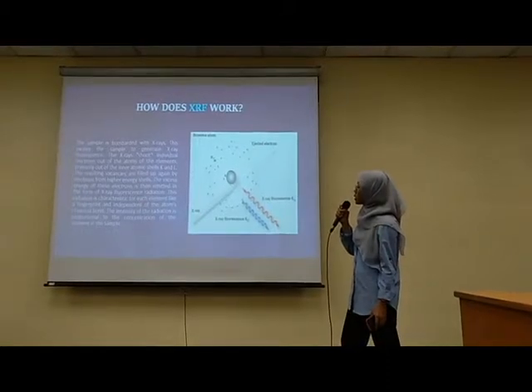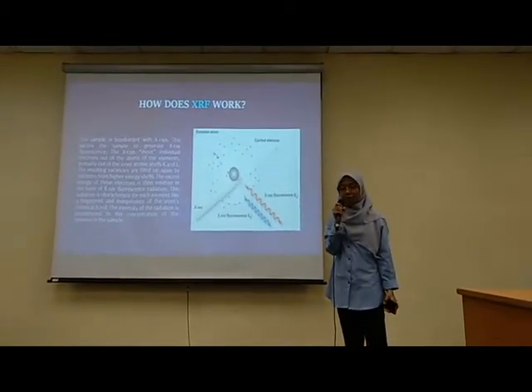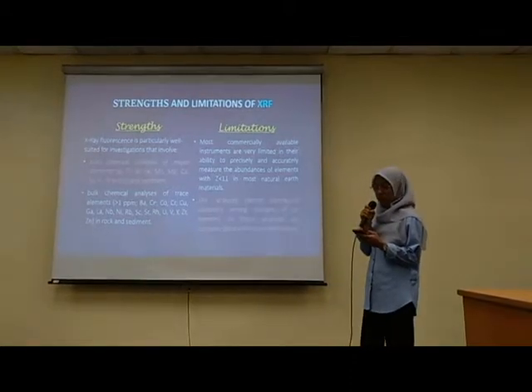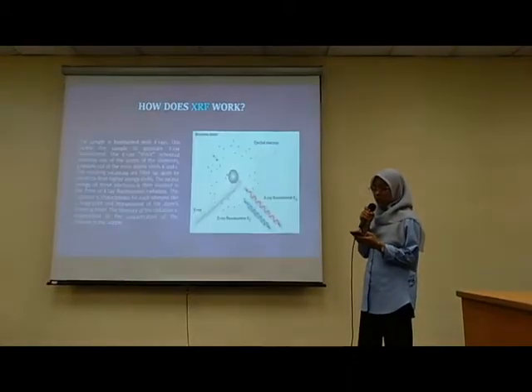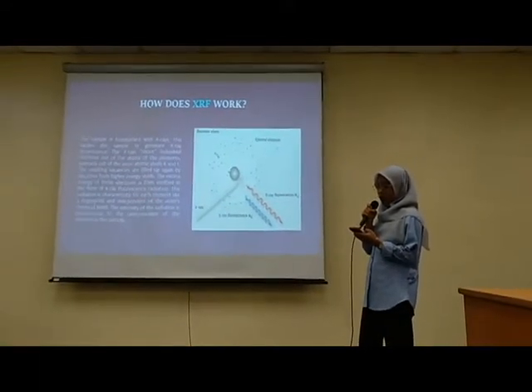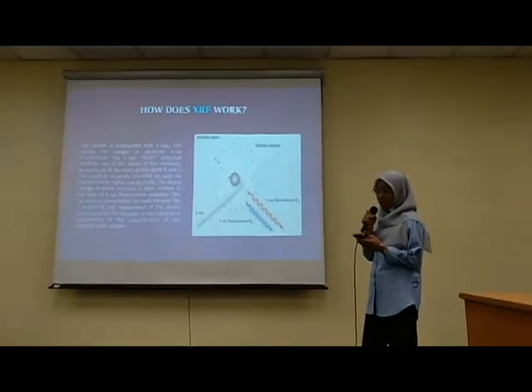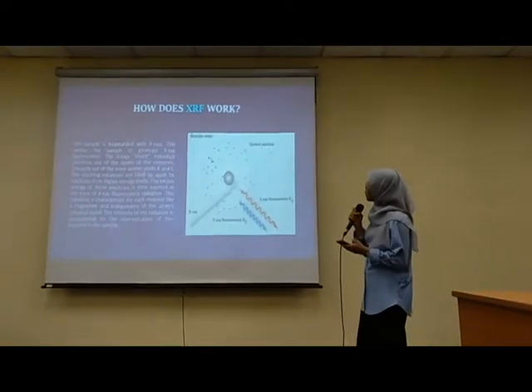The intensity of radiation is proportional to the concentration of the element in the sample. As a result, a specific amount of energy is released. The energy of the emitted X-ray depends on the difference between the higher and the lower state. Therefore, the radiation also carries information about the atom.